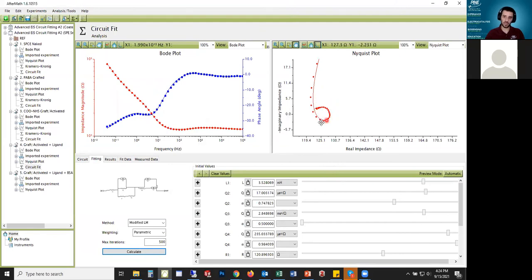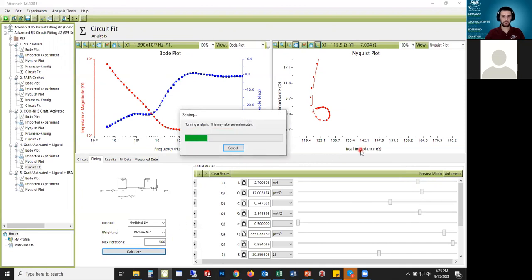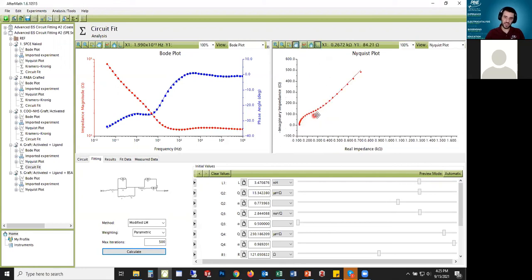In the case where the software doesn't capture that loop, the most common thing you need to do is to adjust the ratio between your inductor and your CPE in that three-tiered model. So this Q2 and this L2 or this L1 and this Q2, you can see that if I change that ratio for example I can make that loop kind of go away. So just the ratio of those two elements is what kind of determines how much of that loop I'm going to have basically. But again the main benefit to this model is that I've got a fit for the rest of it, so I can theoretically get a value for the capacitance and the resistance of the rest of my data. And that has a lot of value to it.